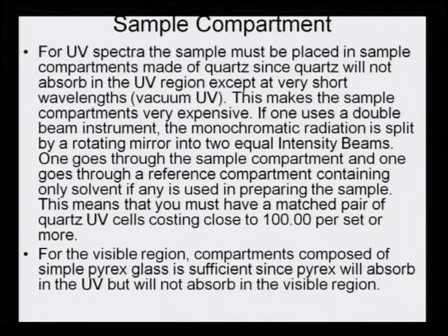For the visible region, the compartment is made of simple Pyrex glass, and that is sufficient because Pyrex does not absorb in the visible region, but it absorbs in the UV region. So, one cannot use it for analysis of the UV region, but if we take quartz, we can use it for both the UV region and the visible region.